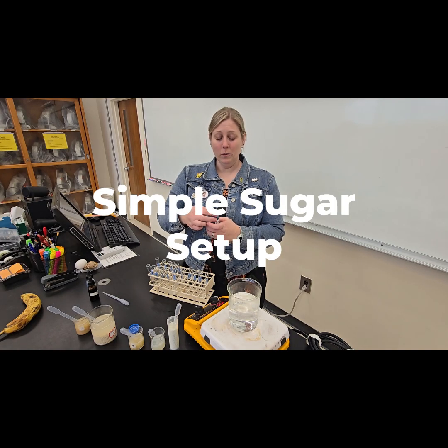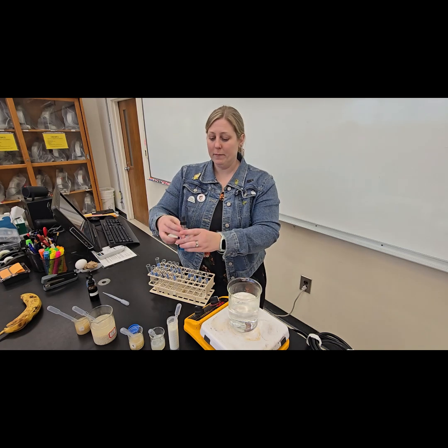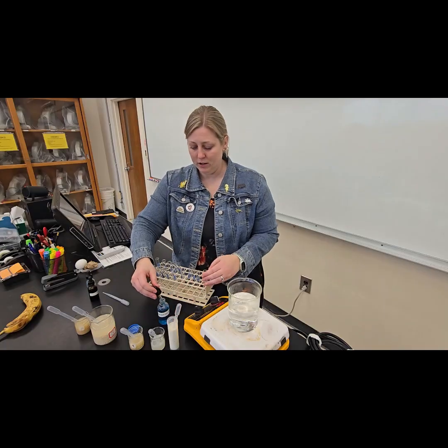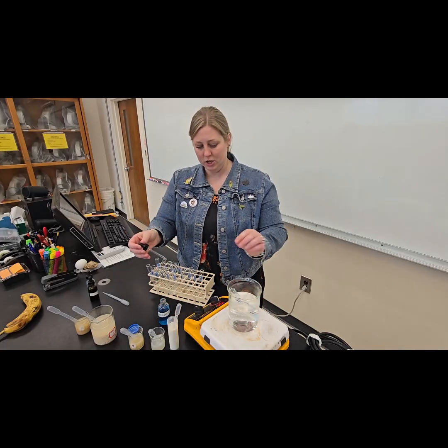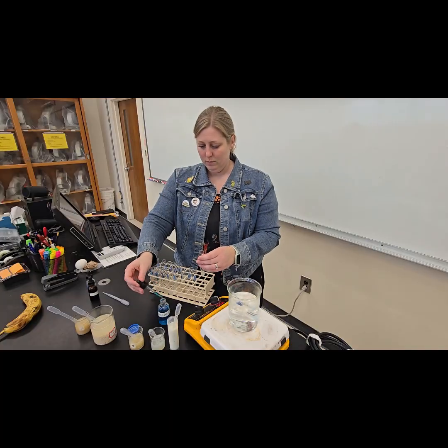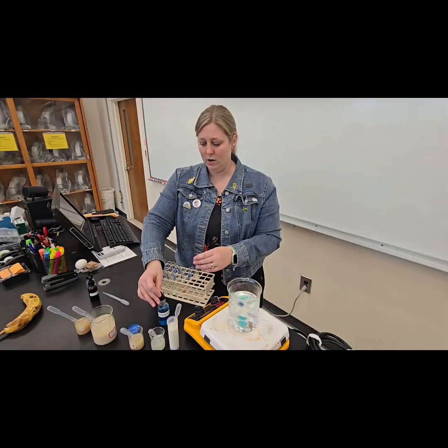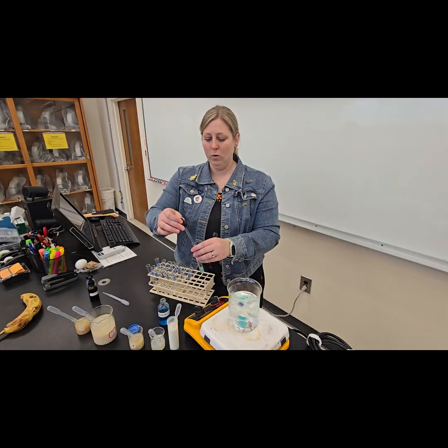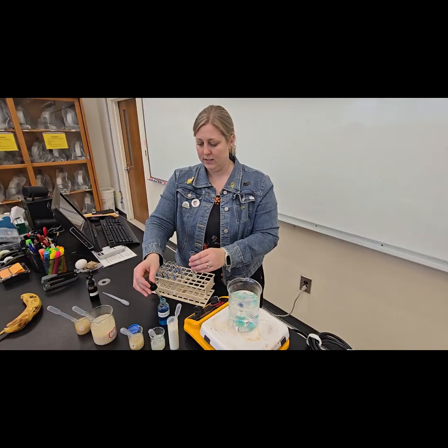All right, so we're gonna do the same thing as we did with our positive and negative controls. I'm gonna set up my Benedict solution. So I'm gonna put a dropper full of Benedict solution in each of our test solutions and stick those in our warm water bath. The warm water is required to get a solid result on this particular test.